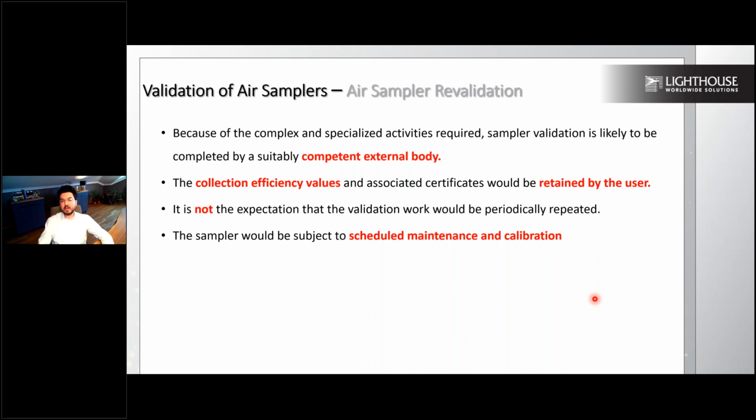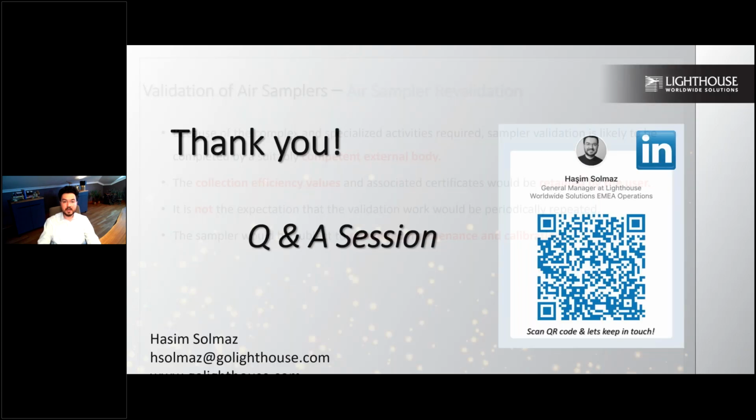Please do not mix it up with the IQOQ protocol. IQOQ is installation qualification and operational qualification, which you conduct in order to adopt this device into your production. But the validation of a sampler is to verify that this device has good biological and physical collection efficiencies. So these are 2 different individual activities, and the validation has to be done by the manufacturer. But if you want to do a biological efficiency test side by side of your device, feel free to do it. The definition is made by the EN norm. Under this session, we came to the end.